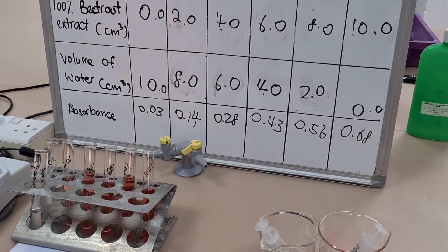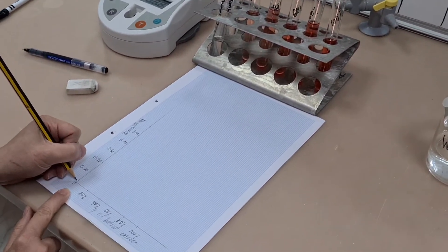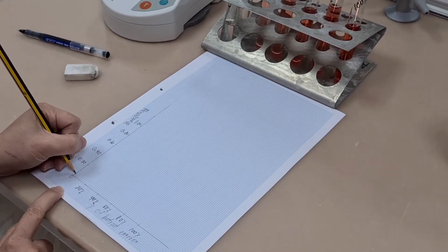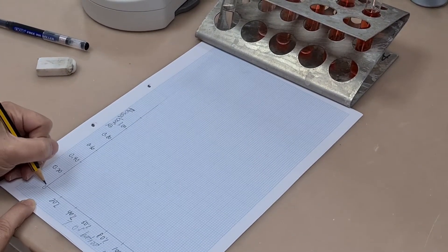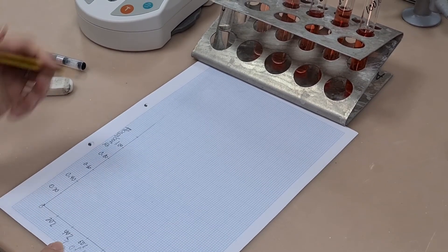And up the side, we've got absorbance. Now there's a couple of errors with this graph. There's an error on the x-axis and there's an error at the point where the x-axis meets the y-axis.